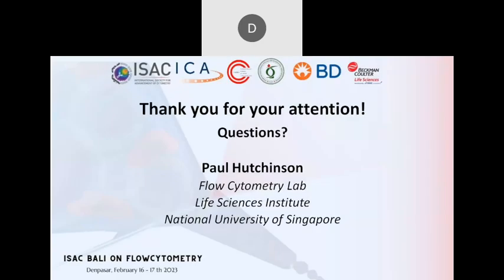What is the sensitivity and specificity of flow cytometry in detecting the presence of Mycobacterium tuberculosis? And then, can flow cytometry displace the TCM or rapid molecular tests like GeneXpert?